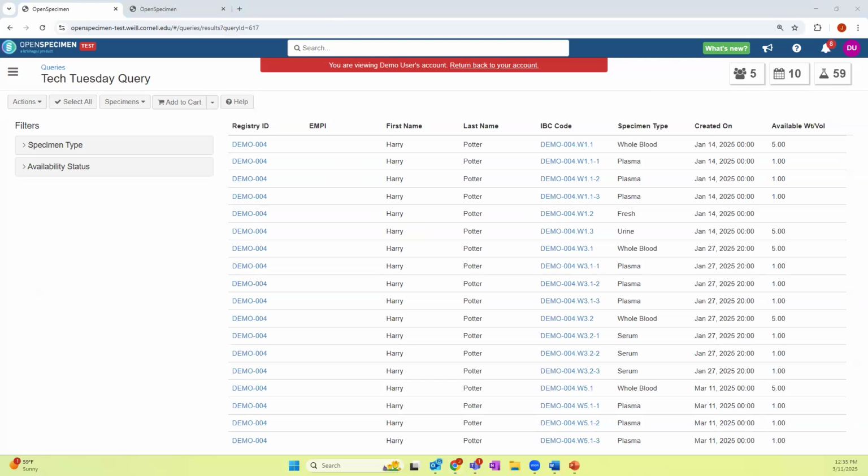Thank you, Karen, for addressing Bing's question. Yes, we can use OpenSpecimen to generate individual barcode labels. OpenSpecimen, we can configure to also send label print jobs to label printers. So yes, all of that can be accommodated.